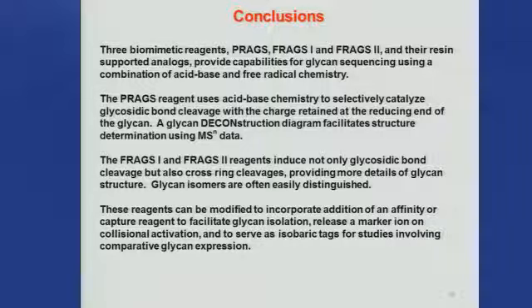You can think of it as a reagent that you can use over and over again. The free radical reagents are like a rattlesnake. It's got one good bite, but now your radical's off somewhere in the molecule, and you can do MSMS in there, but it doesn't always reference everything back to the reducing end of the sugar. And the resin-supported analog gives you capability for glycan structure analysis.